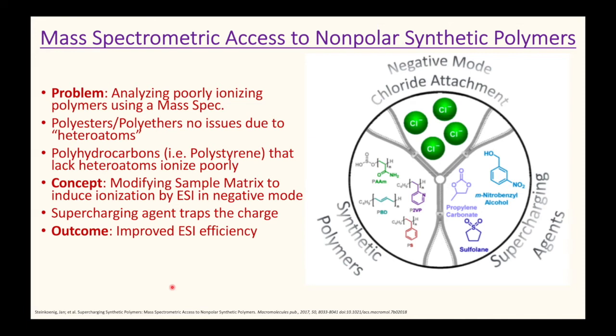This is a very important distinction because we could minimize the sample preparation criteria to analyze a wide range of polymers without really having to utilize different ionization sources or using different matrix additives to help improve the ionization efficiency that we see with MALDI.